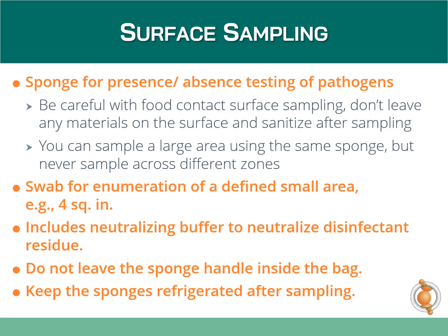The key is to not allow your gloved hands or any part of the handle that have touched your gloved hands into the bag. Lastly, put your collected sample into refrigeration as soon as possible so that no microorganisms can grow and alter your results.